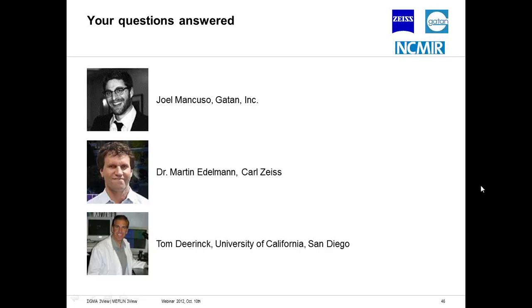We have something we call multiple ROI, where we take a very low mag image and then draw several regions of interest on that image, and we take one slice and go to each of the ROIs, acquire an image, and then cut again. So you can acquire from different regions per cut. So the main difference is the stages and the cutting thickness.